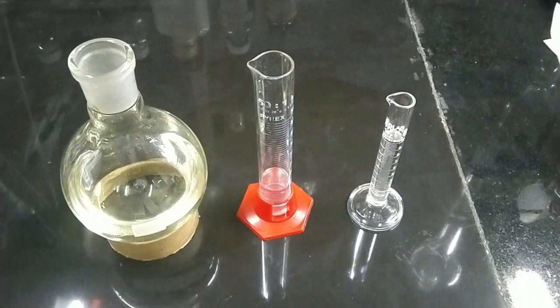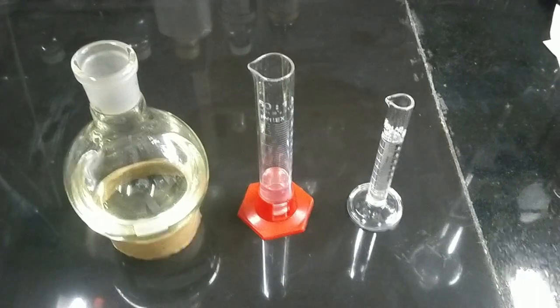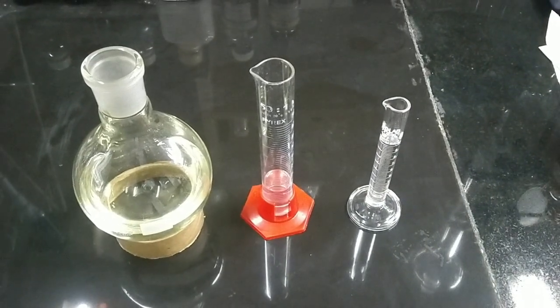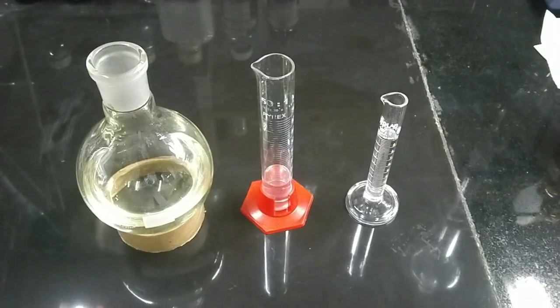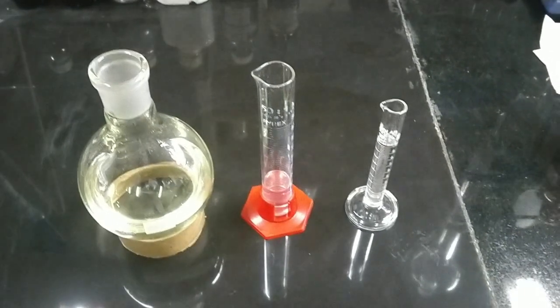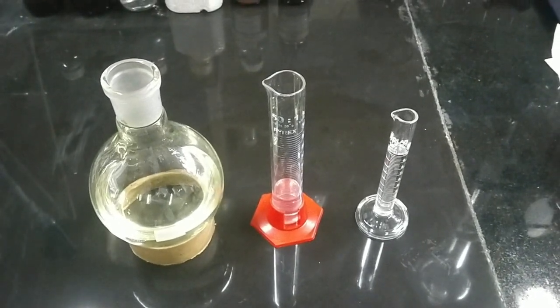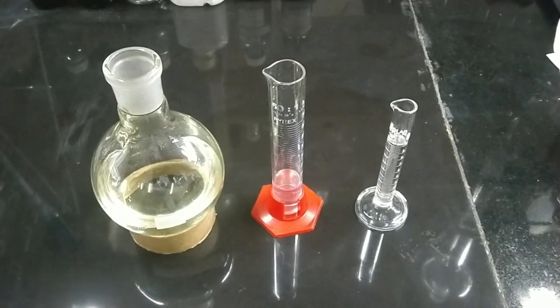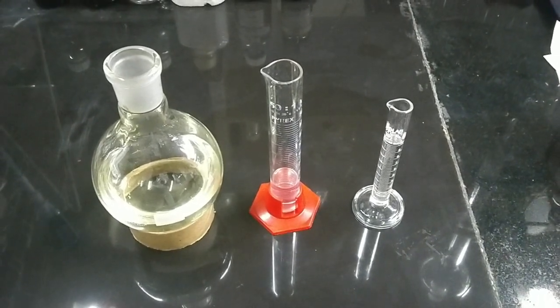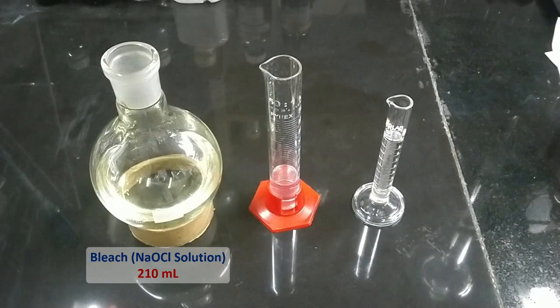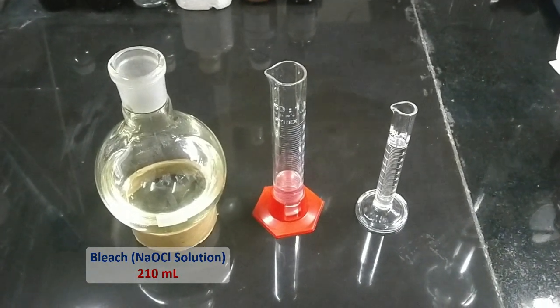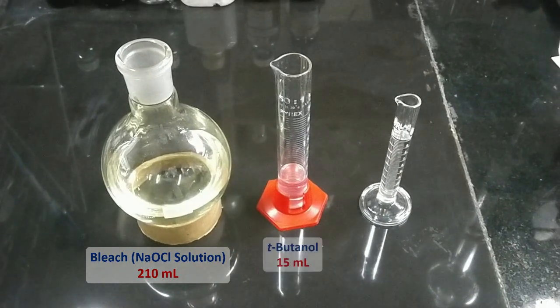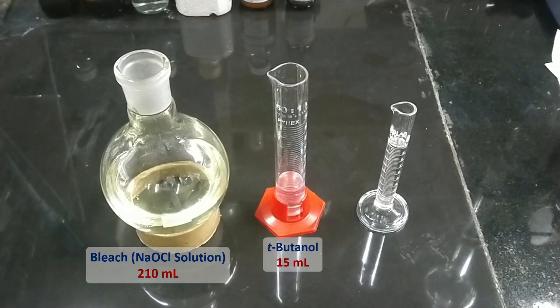Welcome to another video by Mad Chemistry. Today we are going to synthesize tertiary butyl hypochlorite, a chlorination agent. Here I have 210 milliliters of household bleach in my round bottom flask, 15 milliliters of tertiary butanol, and 10 milliliters of acetic acid.